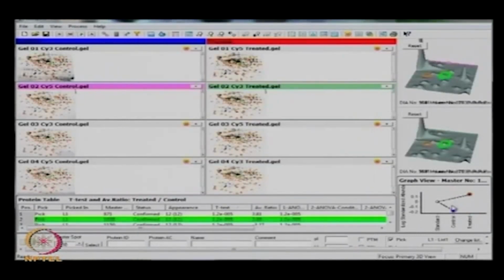These are all things we can identify very easily in BVA. This is very user friendly. There is not much manual interference. Okay, this is what helps you to analyze your dye gels.